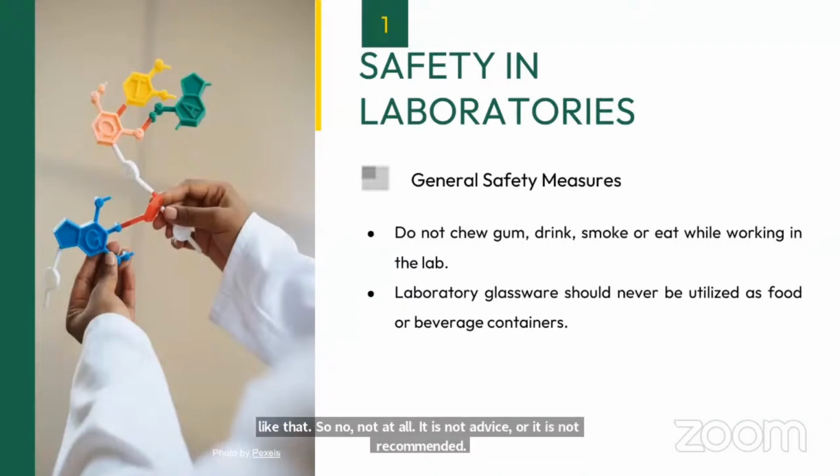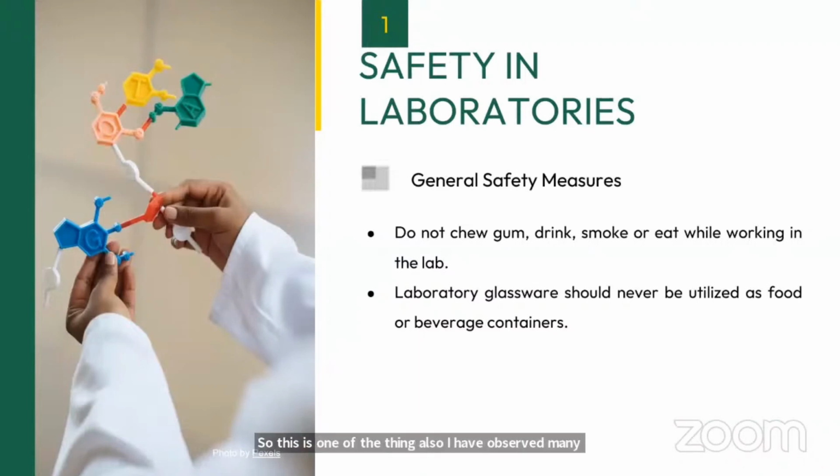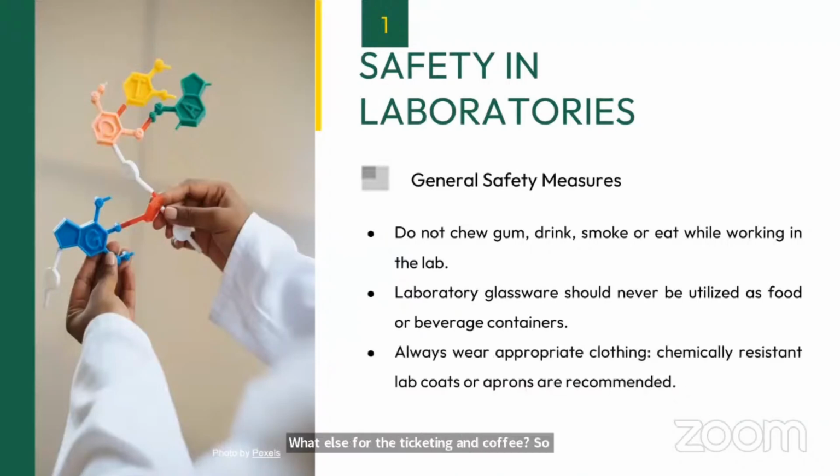Laboratory glassware should never be used as food or beverage containers. This is one of the things I have observed in many places. Many times you will have a microwave in your laboratory, and somebody has brought a lunchbox from home that has become cold, so they want to reheat it. They use the microwave and other glassware in the laboratory. Strictly no, you should not. I am telling you about all these incidents because I have seen them. People use glassware for reheating food, and use glasses and bottles for tea and coffee. All of this happens in the laboratory, so it is strictly no.